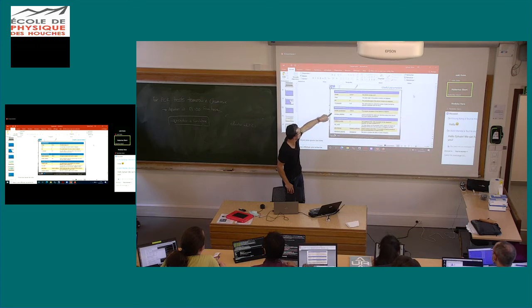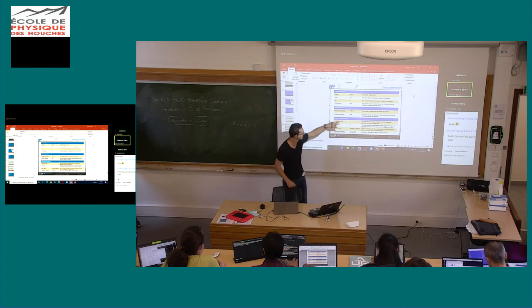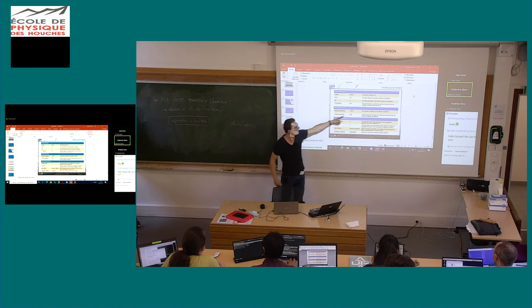Detector parameters, so you have the angular, again, copy-paste error, sorry. Angular acceptance, so usually this is the angular acceptance of your spectrometer. This is probably a few degrees, okay, not 100. And the average sampling: usually in the photoelectron diffraction calculation, you calculate one direction, at a certain angle. If you want to be more representative of your experiment, you can average several directions close to the direction that you are looking for. So this is the average sampling parameter. If you set it too low, I guess, so to none, there is no averaging.